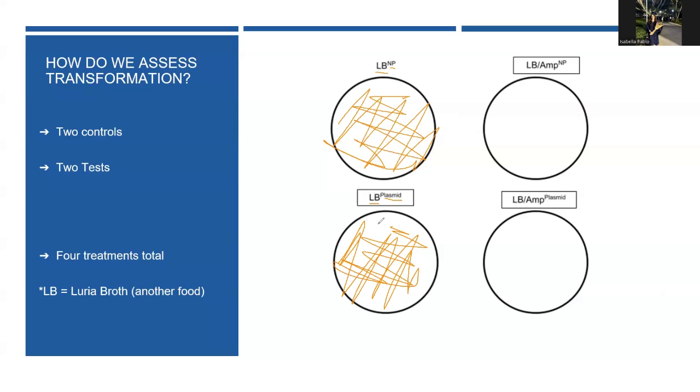It's just regular E. coli with that added plasmid. It's not giving it any sort of advantage. For this plate here, we have LB, and again, this plate is infused with ampicillin.